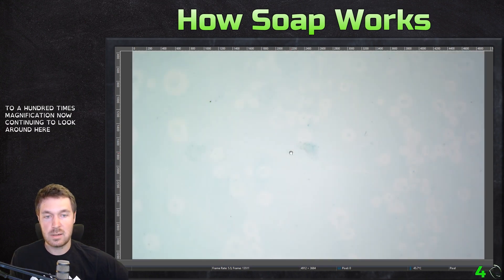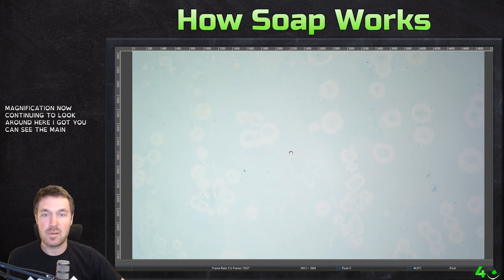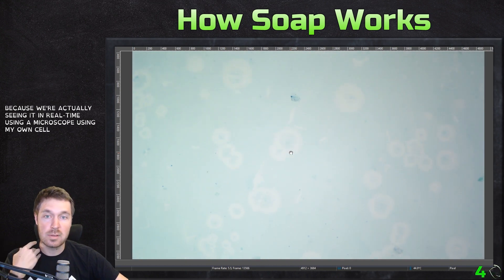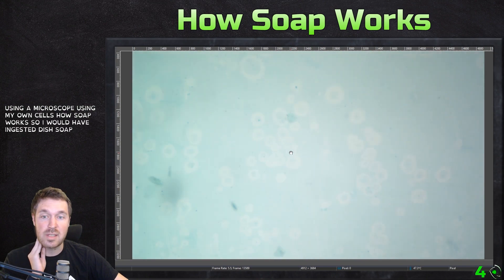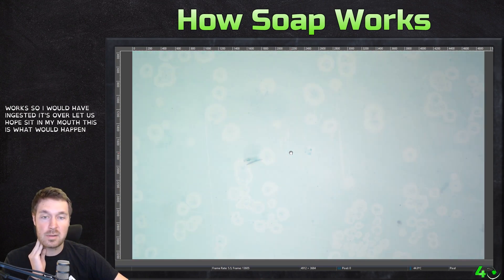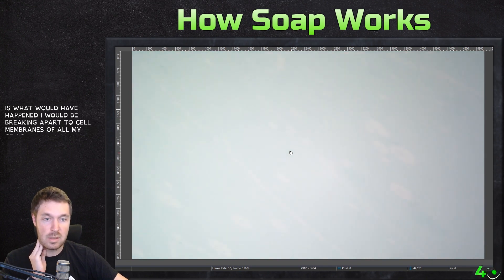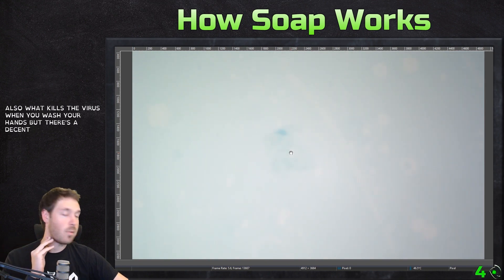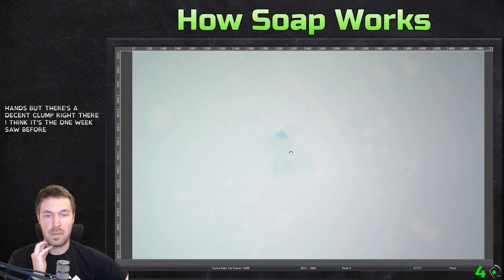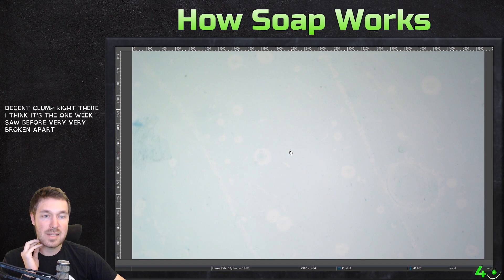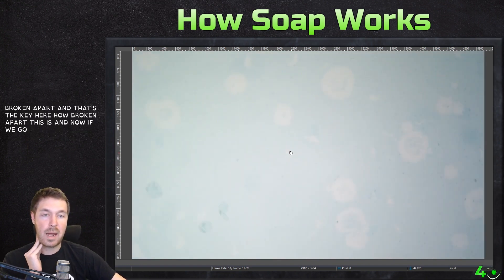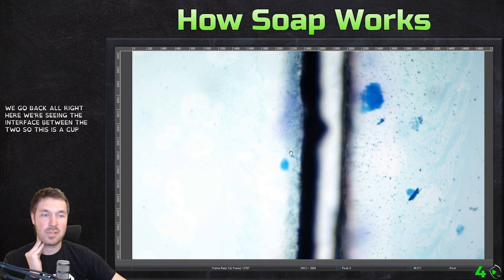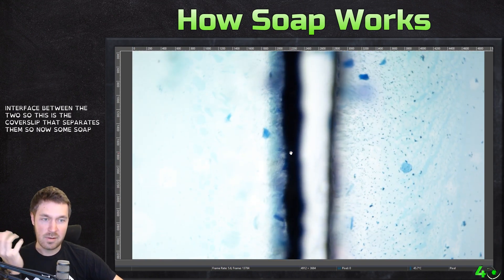Going back to 100 times magnification now, continuing to look around here. You can see the main difference, and this is neat because we're actually seeing in real time, using a microscope, using my own cells, how soap works. So if I would have ingested this soap or let this soap sit in my mouth, this is what would have happened — I would be breaking apart the cell membranes of all my cells. And that's what's so dangerous about eating a Tide Pod, but also what kills the virus when you wash your hands. So there's a decent clump right there — very, very broken apart, and that's the key.